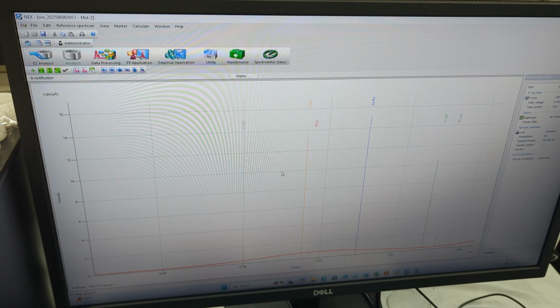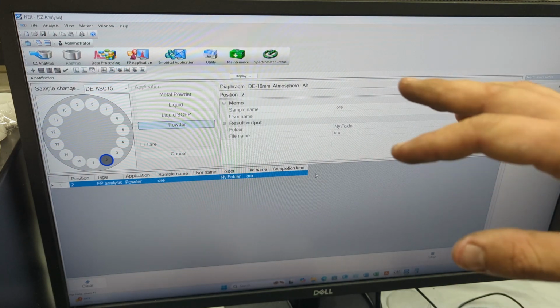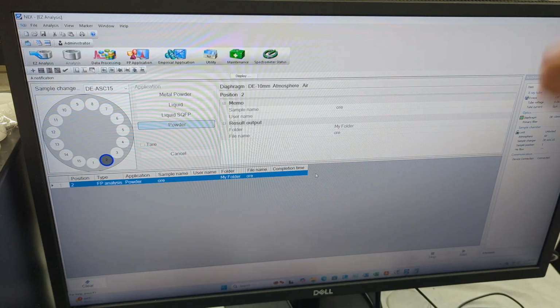And in our case, that's also the second thing that we need this XRF for. So again, the first thing that we needed is a very accurate XRF machine. The second thing that we needed is something that can measure liquids and metal powders. The reason why that's very beneficial for us is because when we're doing the acid leaching, we want to measure the solution before we leach the solution. We measure that into the XRF machine, set that as our reference data, right? And then we measure it again after or while we're leaching the solution and see if there's any gold dissolved, if there's any platinum group metals dissolved, if there's any rare earth elements dissolved, right? So on and so forth.